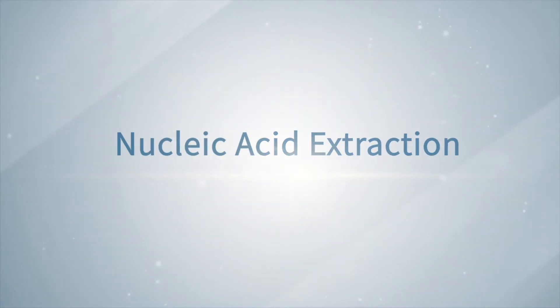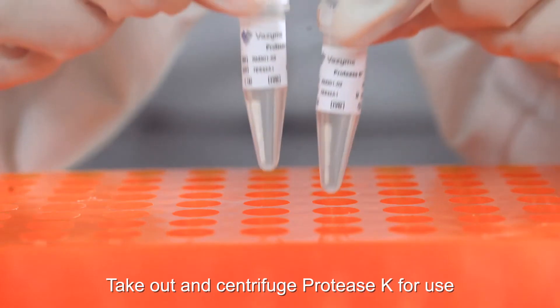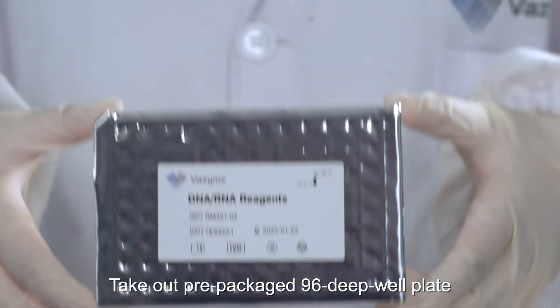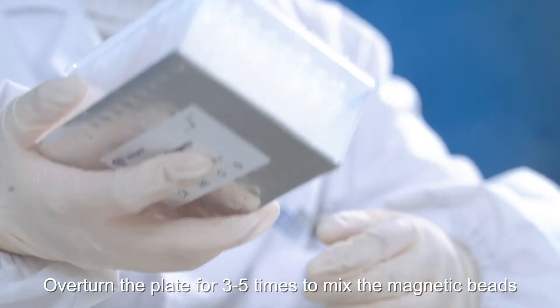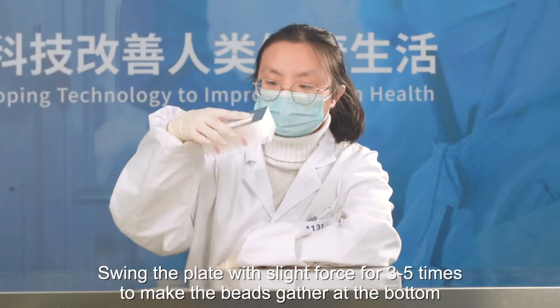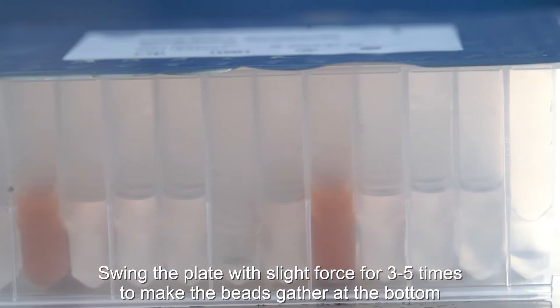Nucleic acid extraction: take out and centrifuge Protease K for use. Take out the pre-packaged 96 deep well plates. Overturn the plate 3 to 5 times to mix the magnetic beads, then swing the plate with slight force 3 to 5 times to make the beads gather at the bottom.